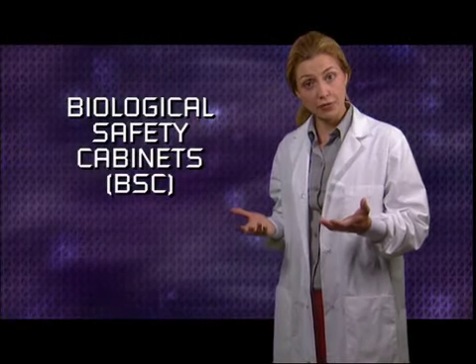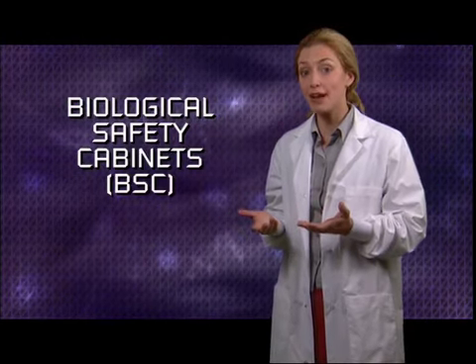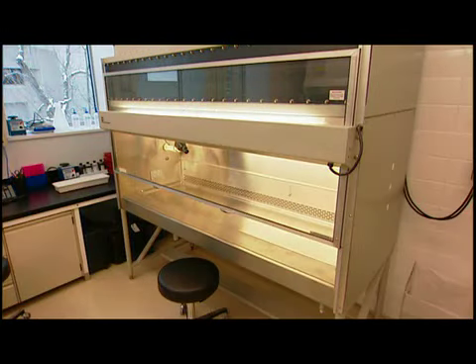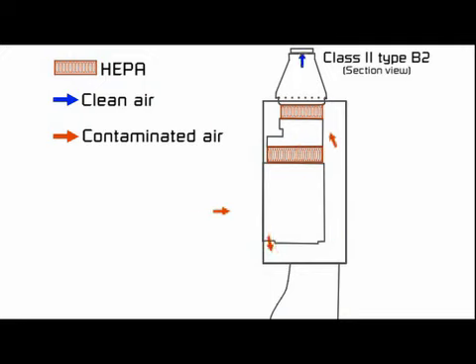In a Containment Level 3 lab, you always handle open vessels containing infectious materials inside a biological safety cabinet, a BSC for short. BSCs provide protection from exposure to infectious aerosols and splashes that may be generated when handling infectious agents. There are 3 classes and various types of BSCs. Different classes of BSCs offer varying levels of personnel, product, and environmental protection. An assessment based on the activities to be carried out in your lab should be undertaken to determine which BSC best meets your lab's needs.